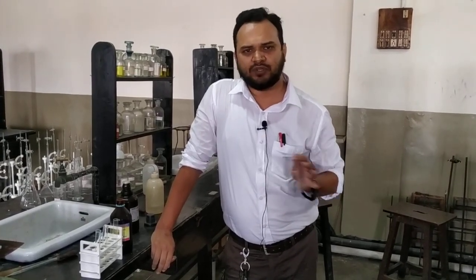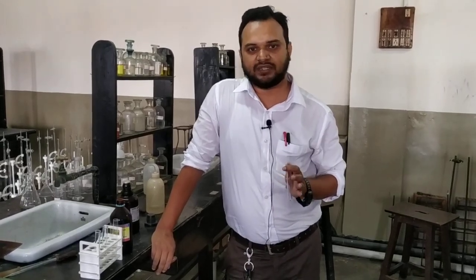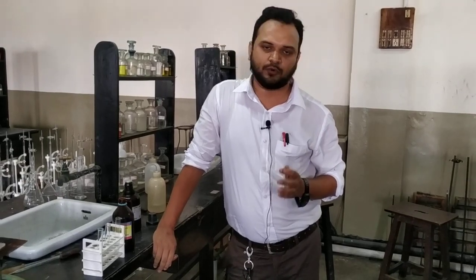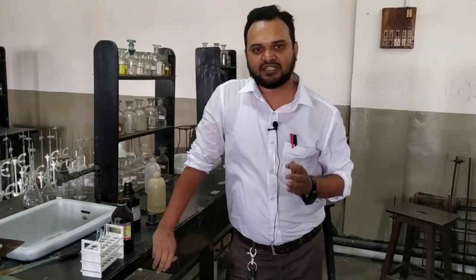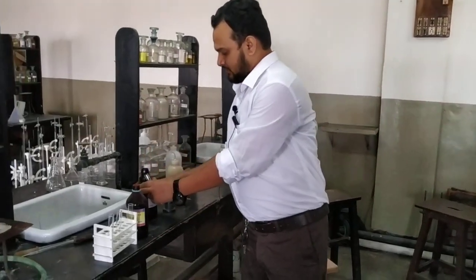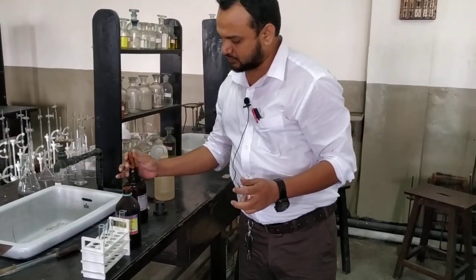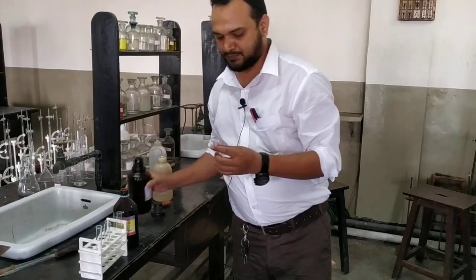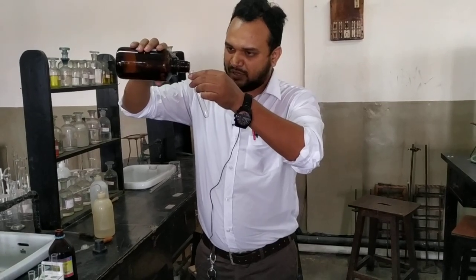So you don't need to even heat, you don't need higher temperature. Only at room temperature the ring is so much activated that it immediately reacts with the bromine water and gives you an immediate pinkish white precipitate. So let us see. And as you know, this aniline is not soluble in water, so we take an aqueous suspension. A very little amount of aniline, about 1 ml.